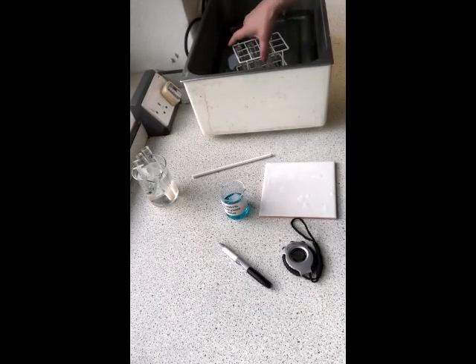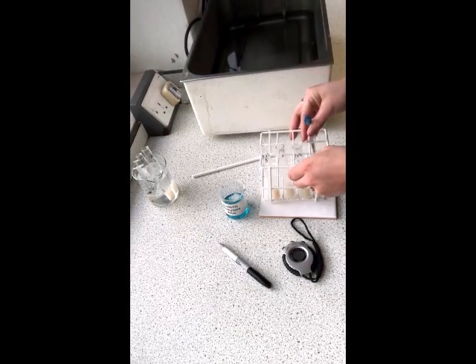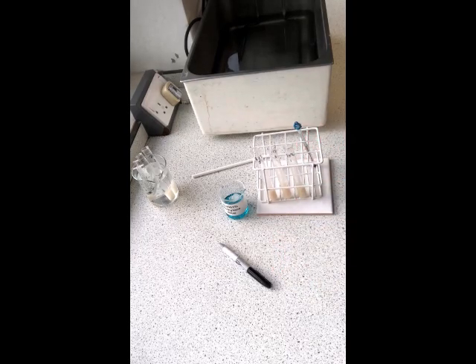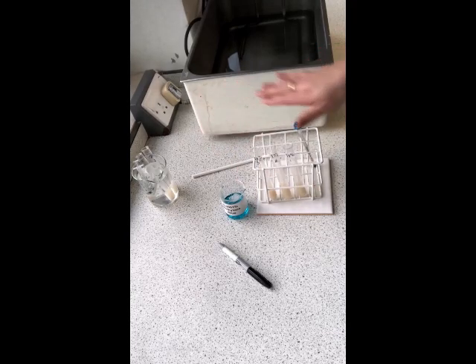Okay, so again I have managed to, in the intervening time, repeat this for all the tubes, and you can see hopefully that they have all become colourless, and this was far quicker. So what we had this time is we had roughly 2 minutes for each. So tube number 1, that changed colour in 126 seconds. Tube number 2, that took 112, and tube number 3 took 97, which is slightly lower, but we can take an average with that now.